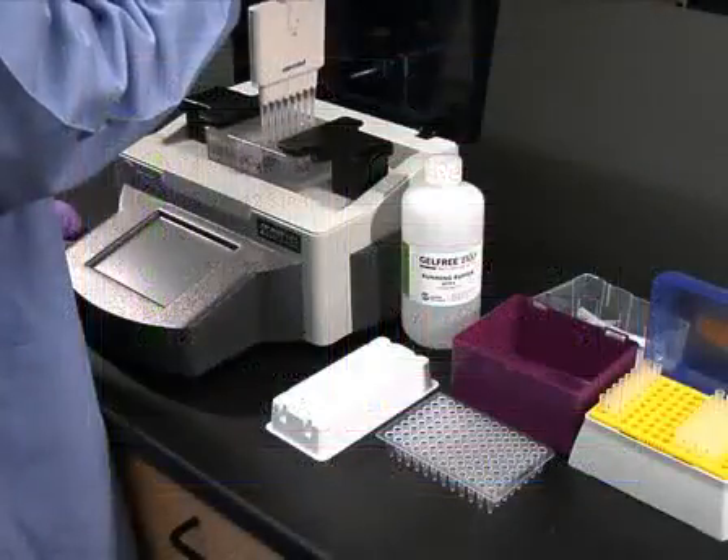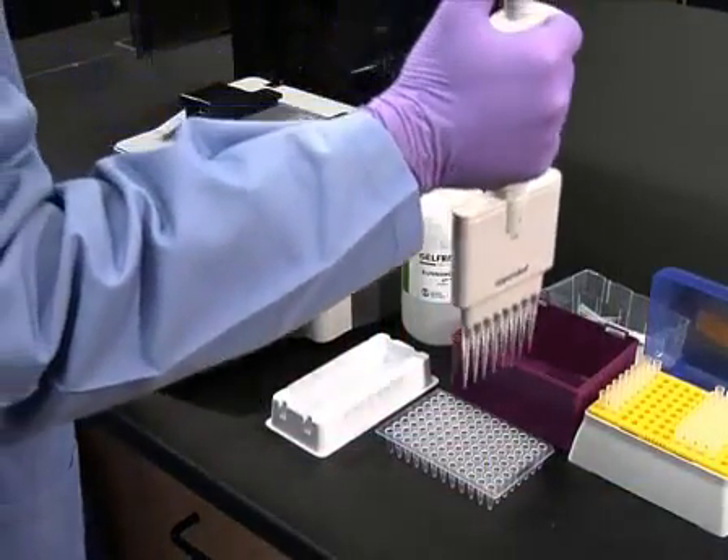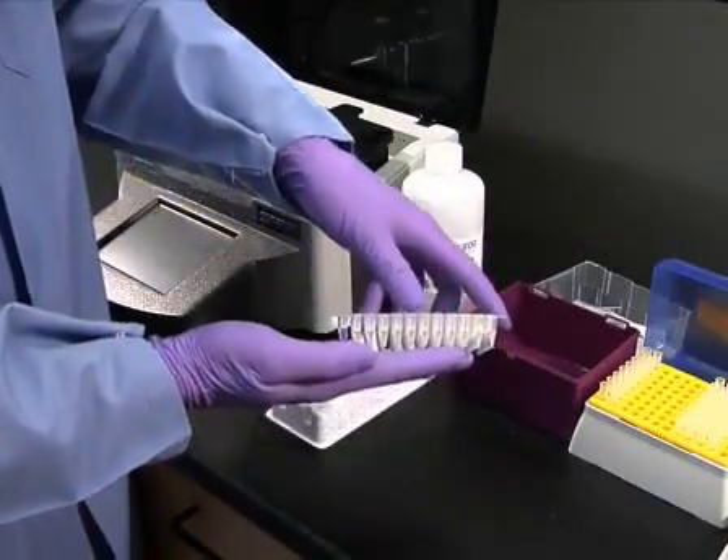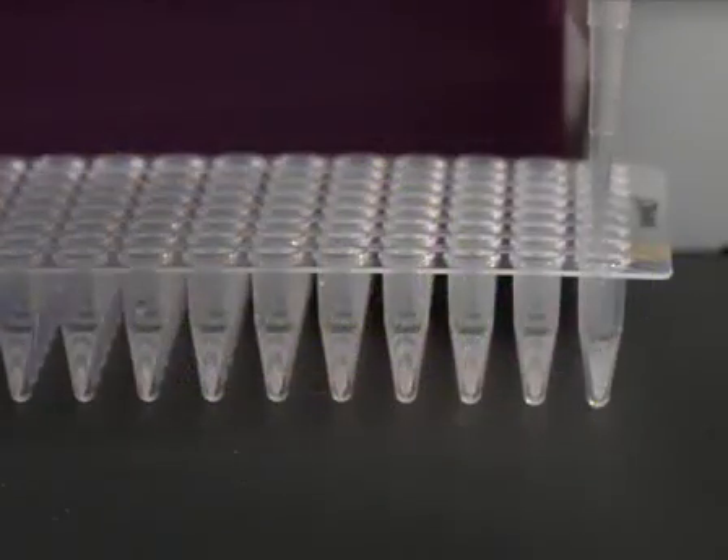Once all of the fractions have been collected, they can immediately be used for further downstream preparation, such as isoelectric focusing or gel electrophoresis, or for analysis using liquid chromatography.